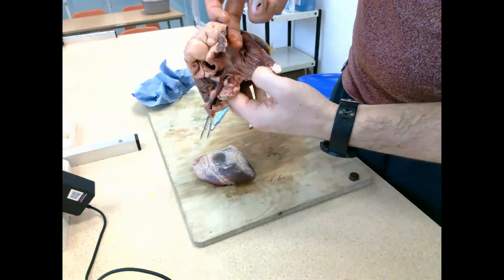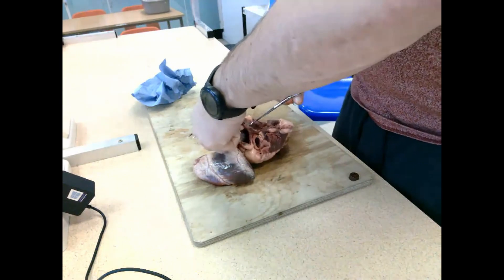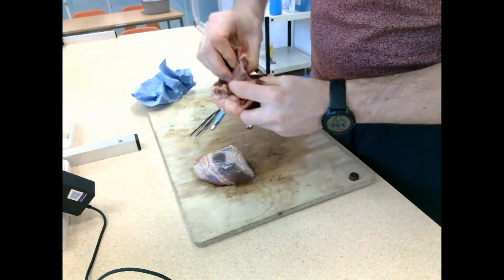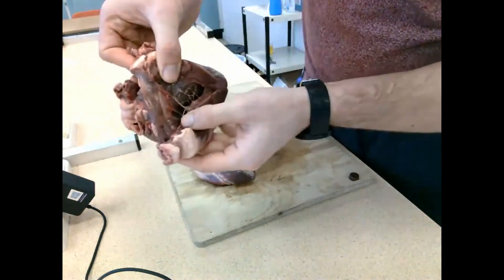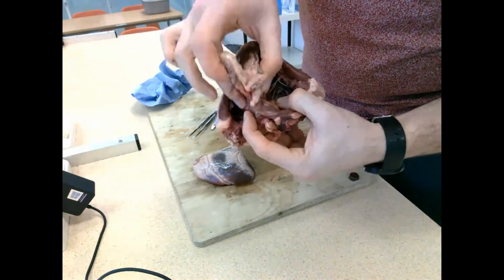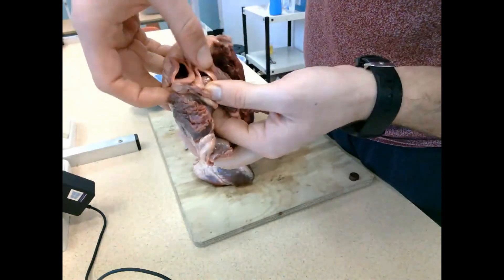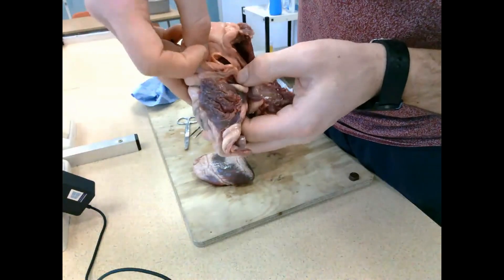I'm pulling the tricuspid valve up so you can see it - it will open and close during a heartbeat to allow blood through from the atrium into the ventricle, then snap shut once it's pumped through. Cutting through to show the septum, which separates the two sides - the right and left are completely separated to ensure that oxygenated and deoxygenated blood doesn't mix.